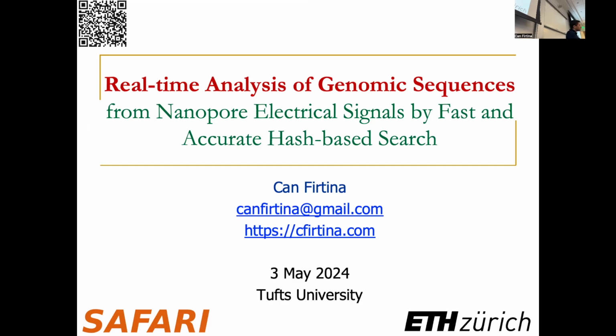This is the stochastic part. But we also look at whether it is all stochastic, right? We also see a particular pattern where certain bases matter more. The signal that we're generating is for a particular k-mer, but when we look at it more closely, what we see is that usually the fourth or the fifth base of that k-mer is affecting the signal much more than any other base in the k-mer.